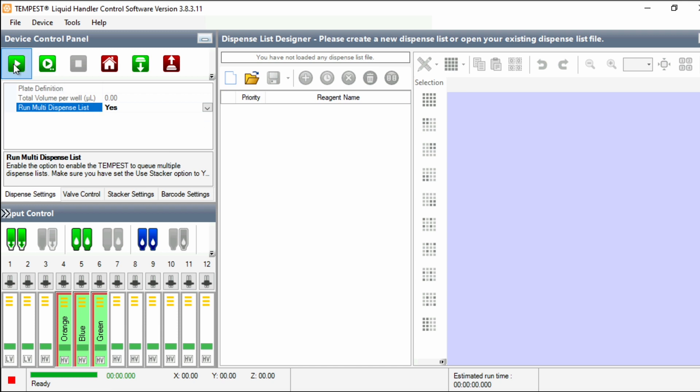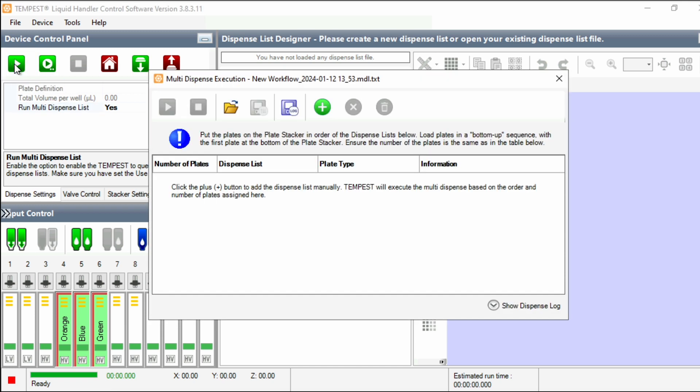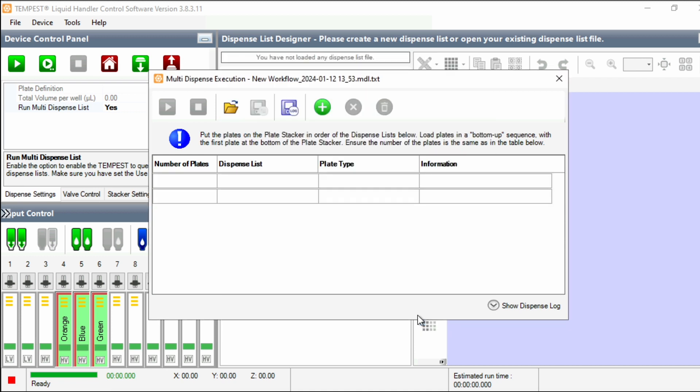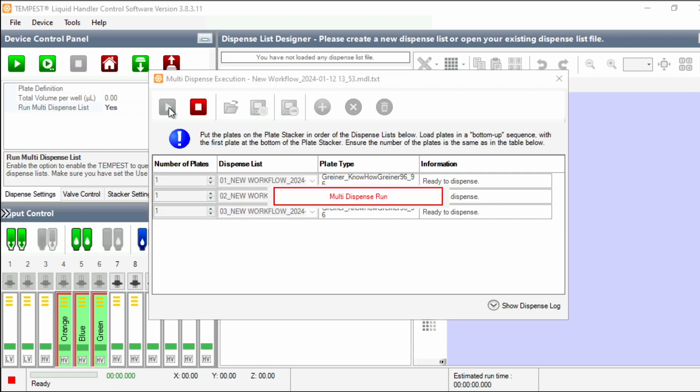Now, if you click Play, you'll be prompted to select that Multi Dispense List file that we downloaded earlier. So let's select that and it will automatically pull the information from the dispense lists we downloaded earlier and ensure they're run in the order we specified in Synthase.